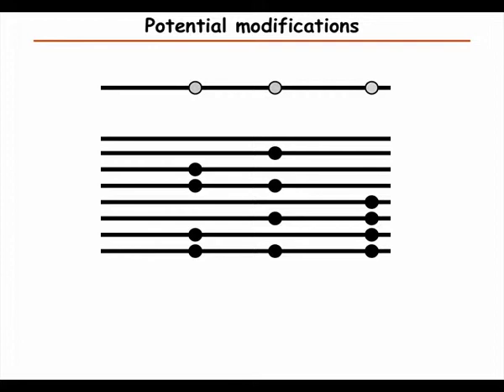In case we don't know anything from the beginning, each of them can be either phosphorylated or not phosphorylated. So this just shows that we have to test all these different possibilities when we do the search to identify the peptides and localize where the modification is.